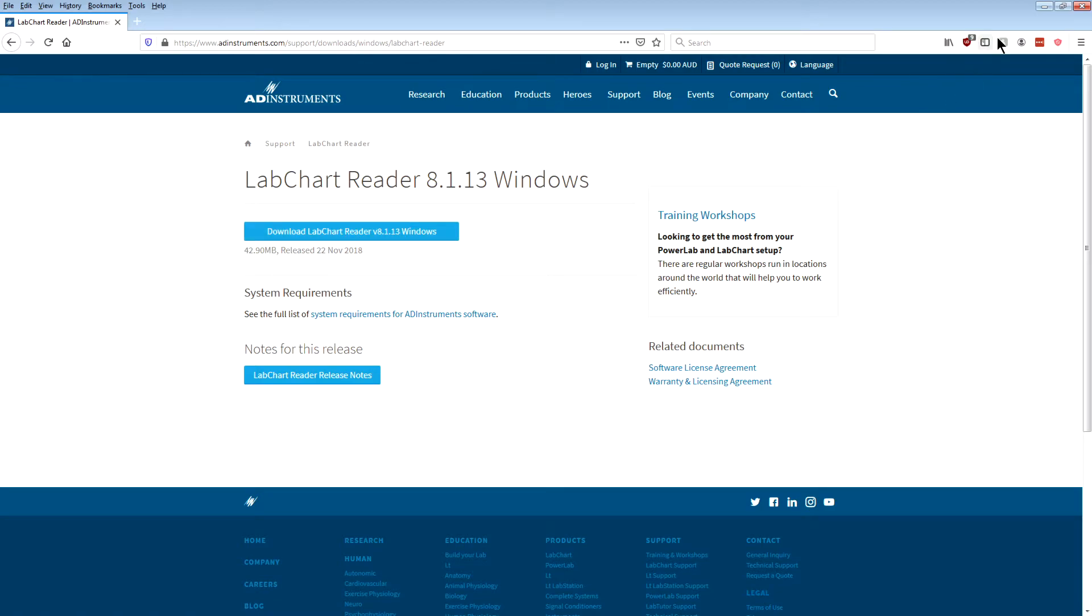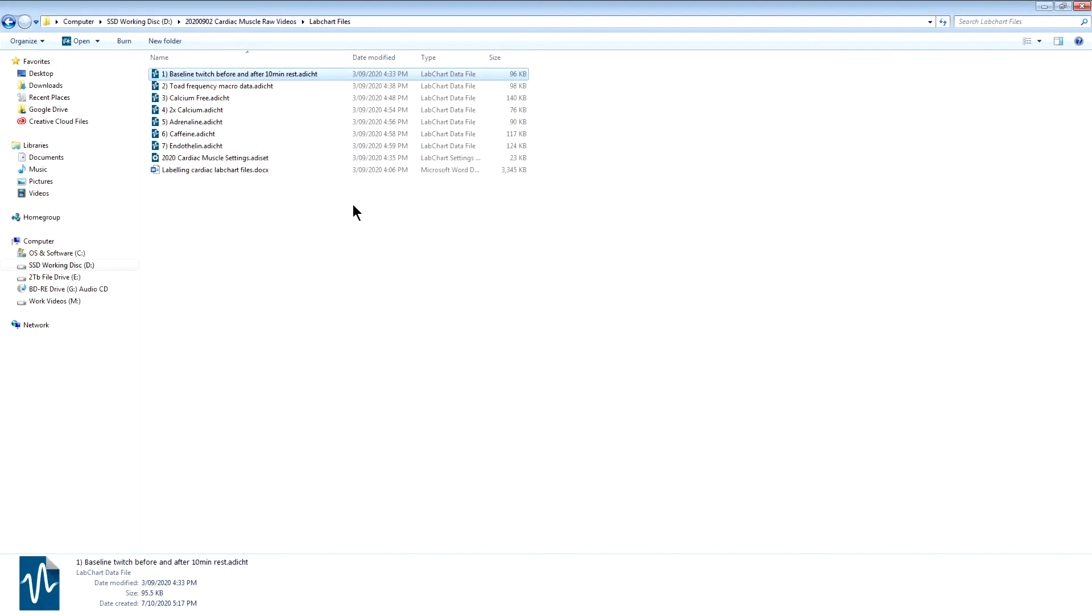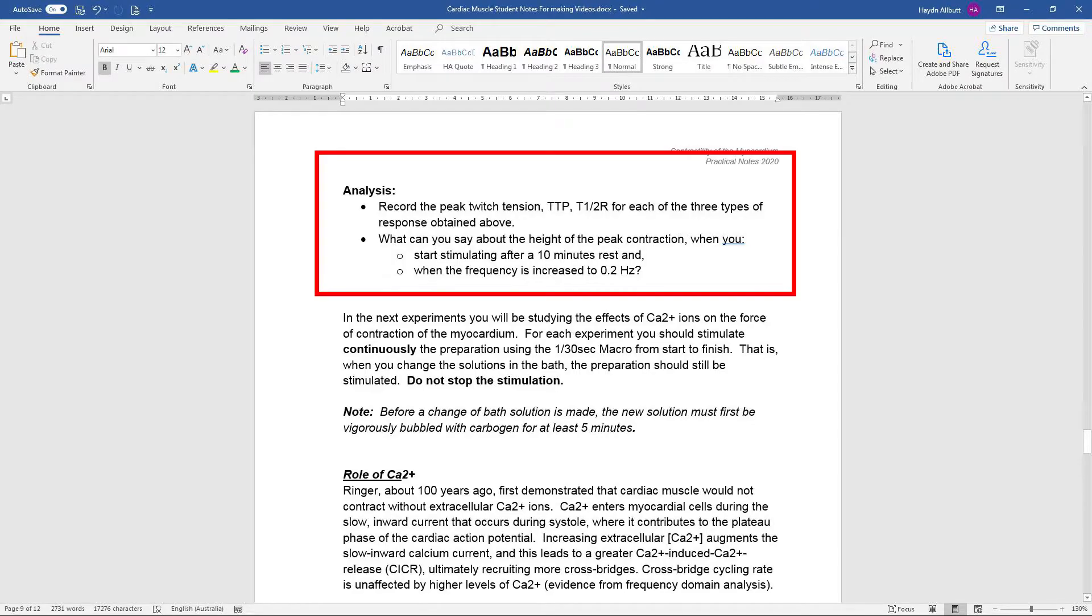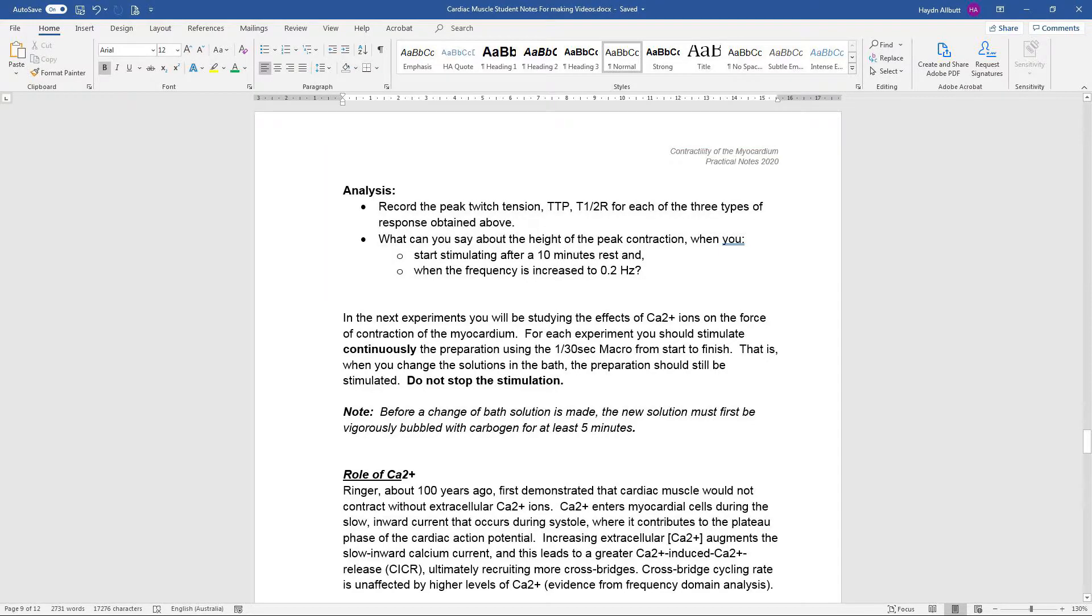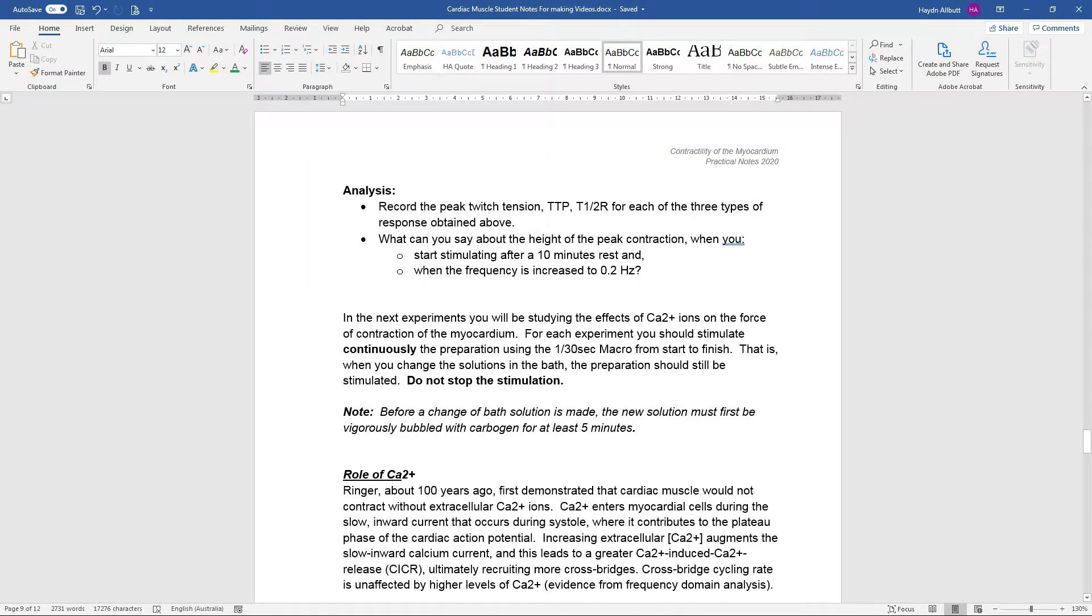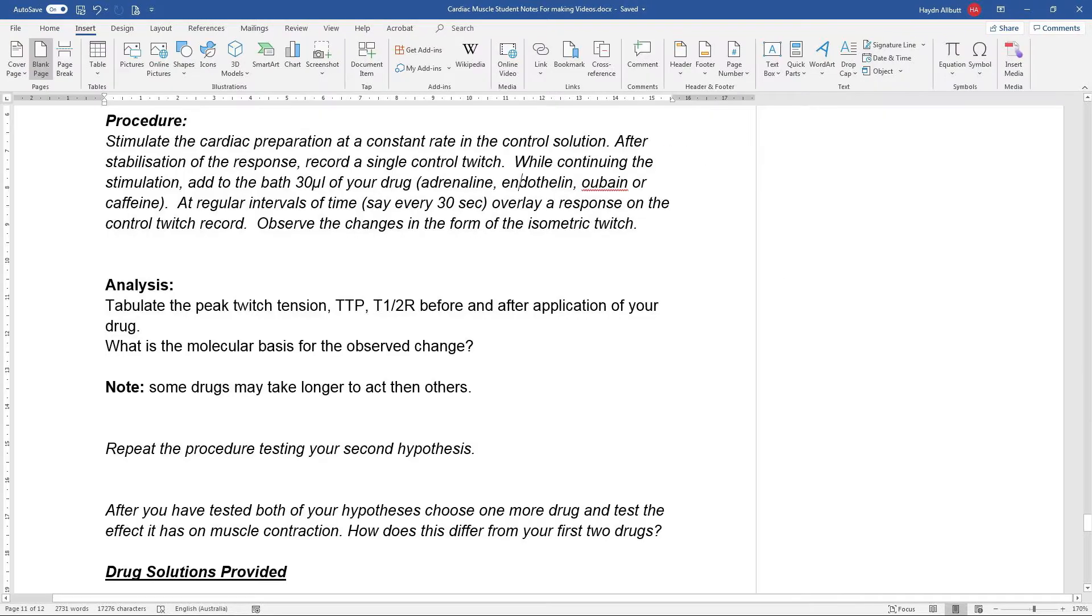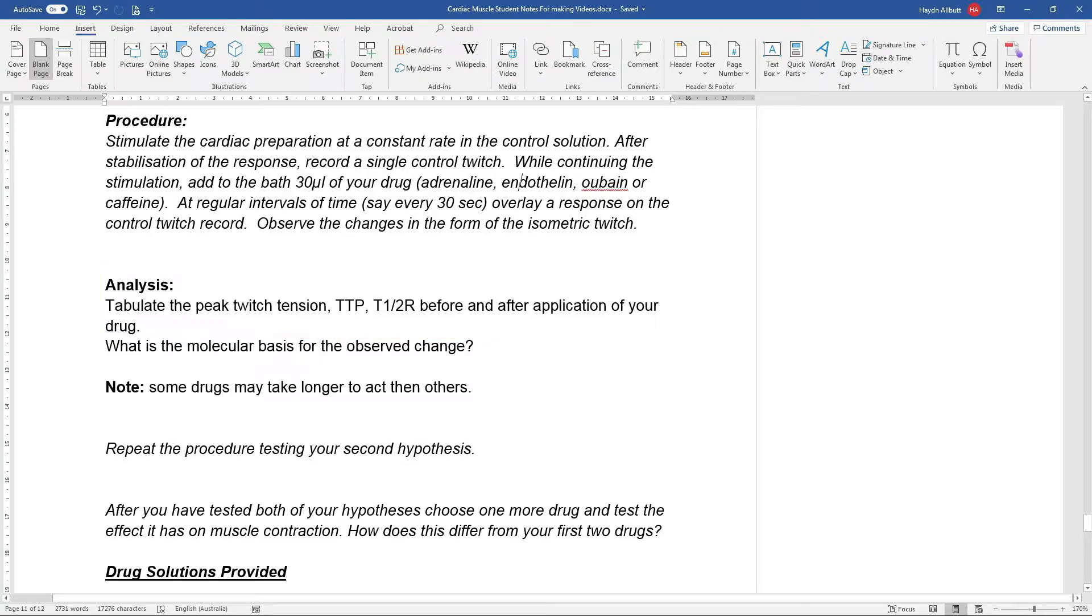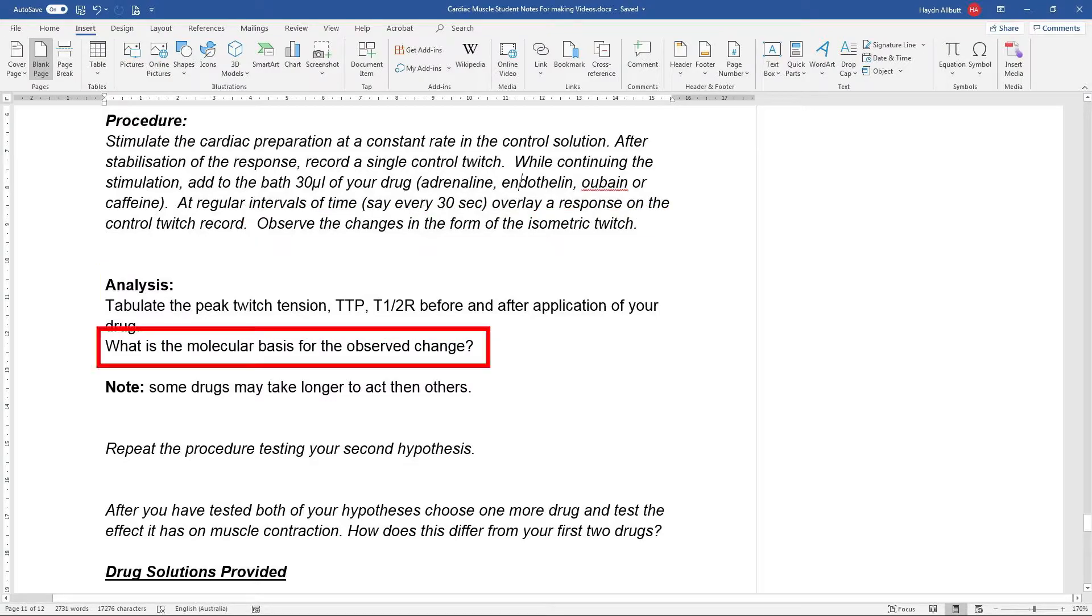Once you've got the software installed, you should be able to open each of the example data files, and there should be one for each of the experiments that you'll need to perform for your lab report. Your notes for this class will describe what you need to look at and what analysis you need to perform for each of the data sets, so you'll still need to perform all the data analysis and describe all your findings and answer all the questions.